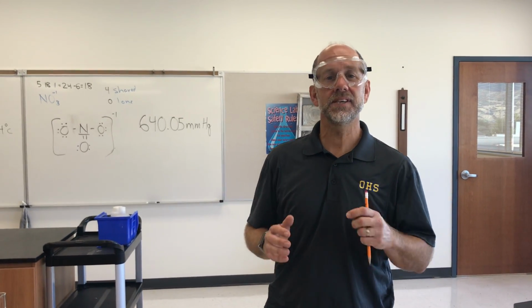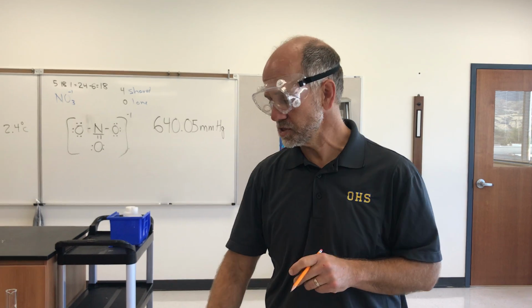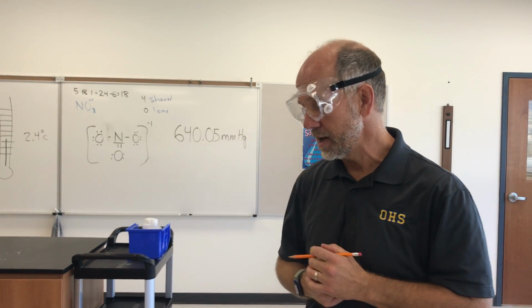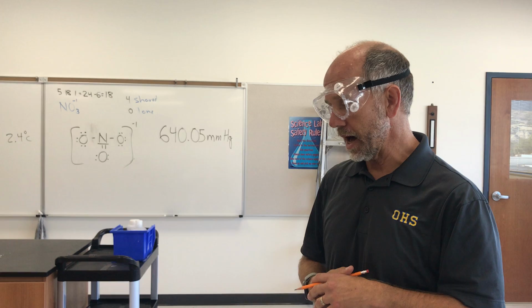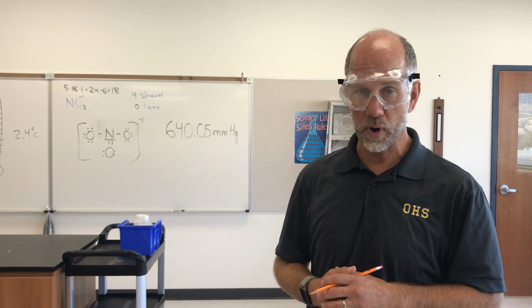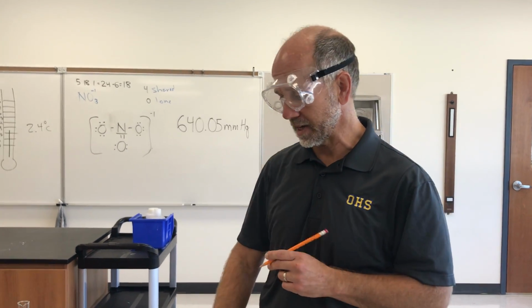All right. Hey, today we're going to do the Law of Conservation of Mass Lab together. In order to be ready for this, you need to have already printed a copy of the lab handout, which is available on our website. In addition to that, you also need to have watched the screencast, which is the instructions on how to carry out and also, importantly, how to write up the lab. So having done this, we're just going to jump in and get started.